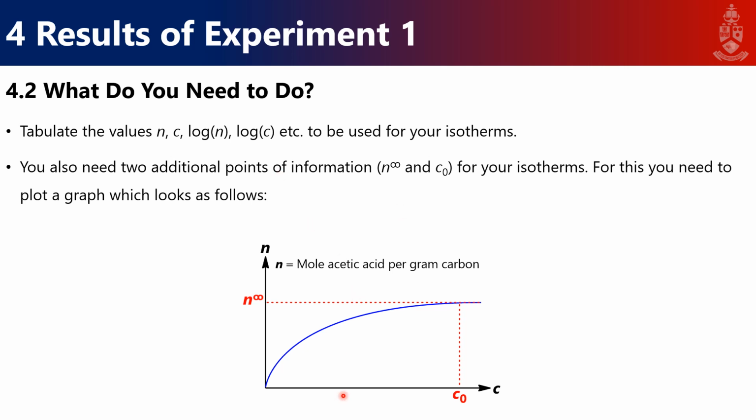So please don't plot here the 0.03, 0.5. This is the one that you determine in the second standardization concentrations. A plot of that should give you a curve that looks something like that, which levels off. And you should ask yourself, why does it level off?